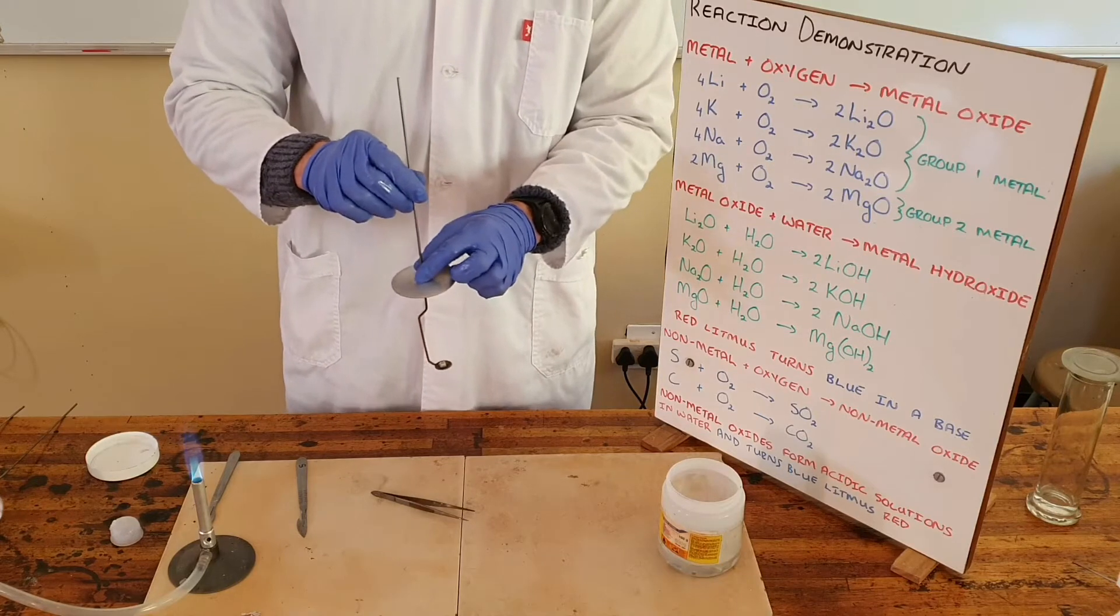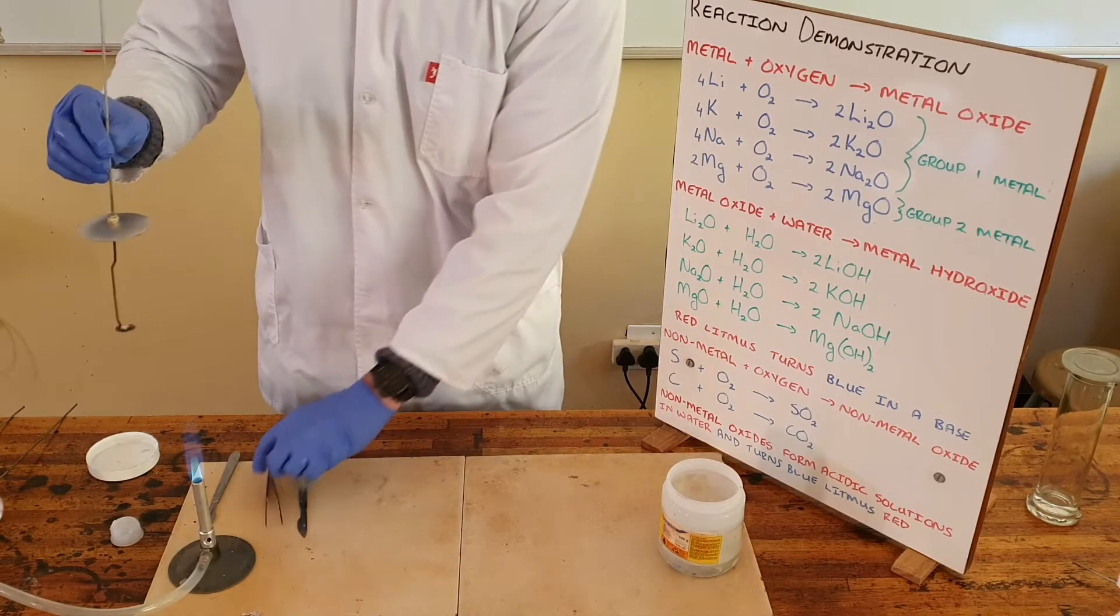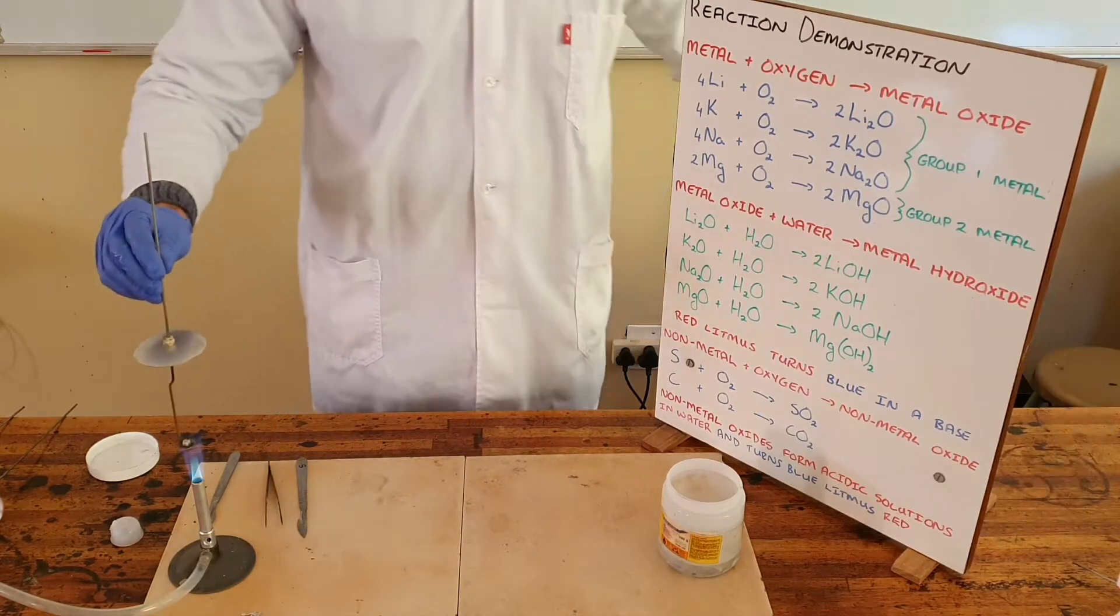What we do is place this potassium piece of metal onto our deflagrating spoon and put this over a Bunsen burner.